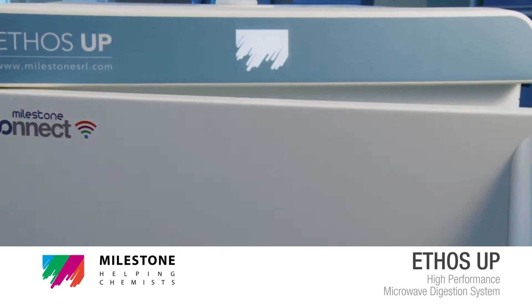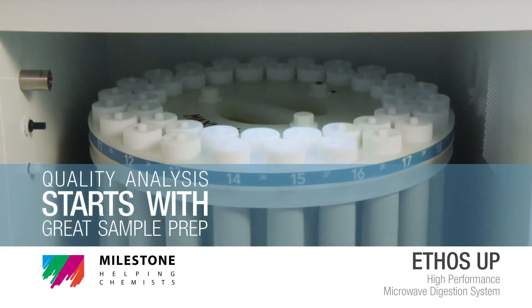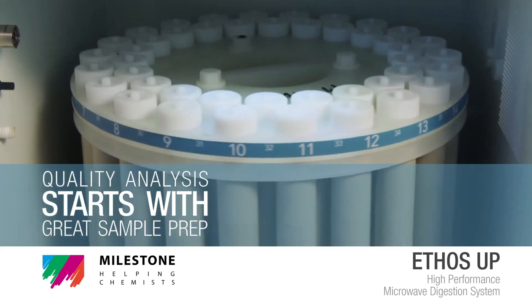Milestone Ethos Up. Quality analysis starts with great sample preparation.